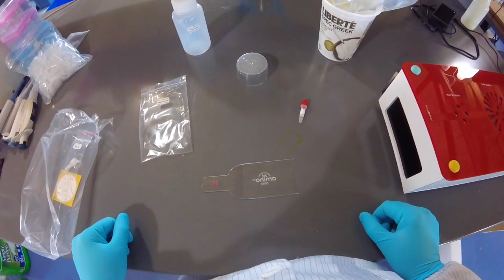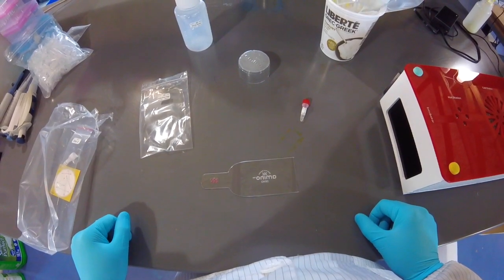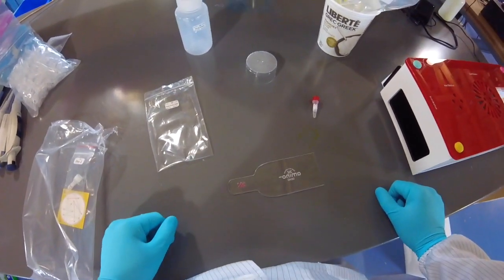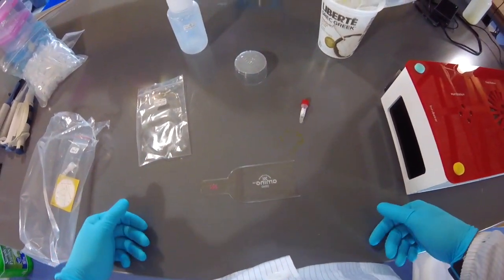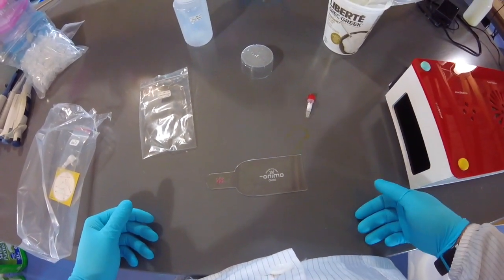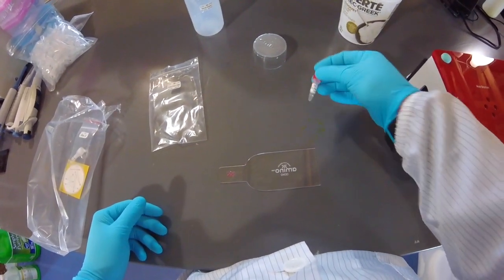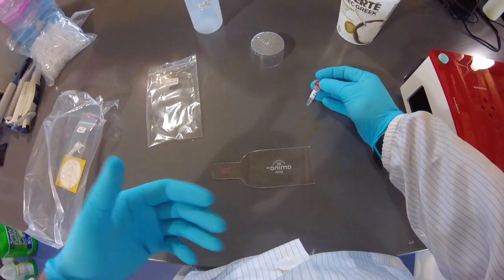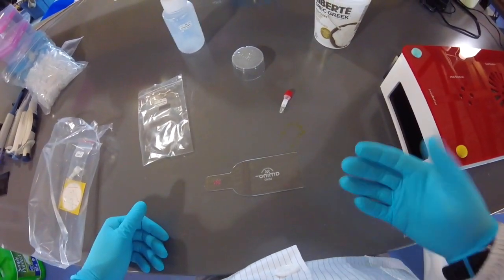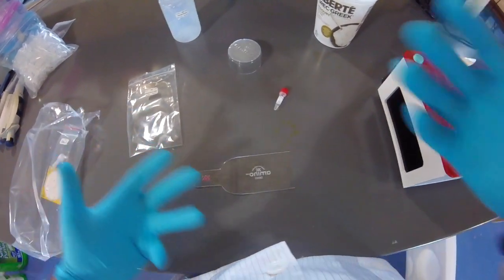Hello. So we are now at day 4 of the engineered kit experience, and essentially today is looking at some results. Just as a quick review, on the first day we made some Petri dishes, 1 non-selective, 3 selective. We then streaked some blank cells, meaning cells that haven't been engineered yet, onto the non-selective plate so that we could get some colonies. On day 2, we collected some of those colonies and mixed them into a T buffer, a transformation buffer, which has calcium chloride, among other things, that help the DNA plasmid get into the cells. We then added a DNA plasmid and did a heat shock step, which was followed up by a recovery step, where we added some recovery media and let the cells incubate overnight.